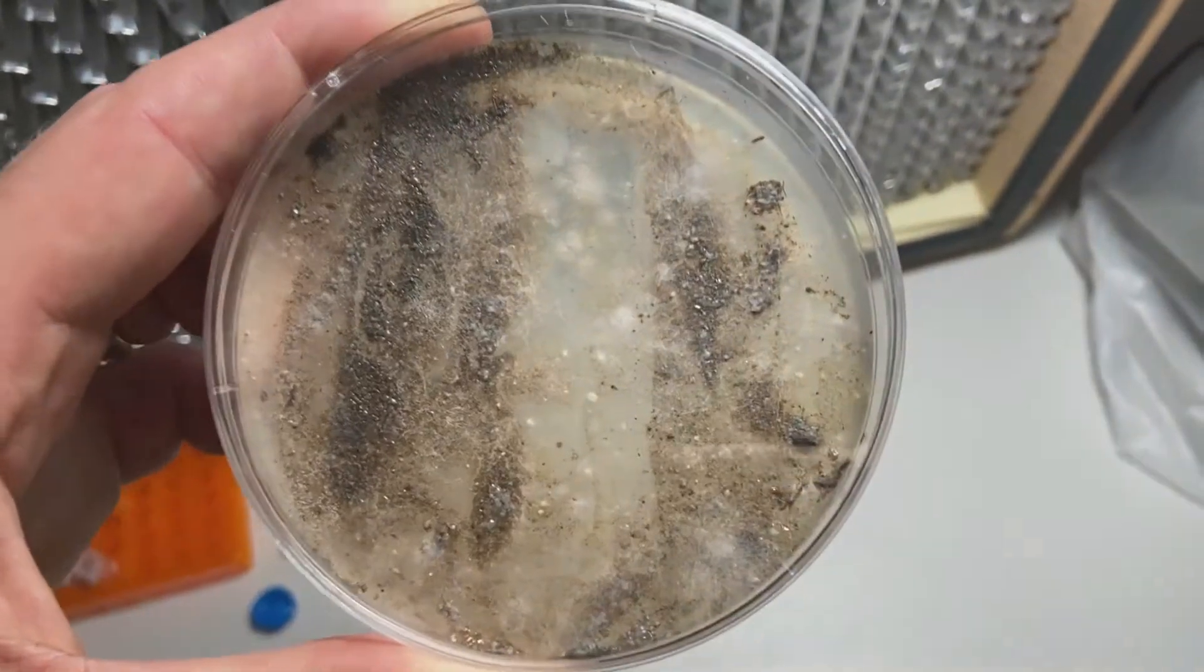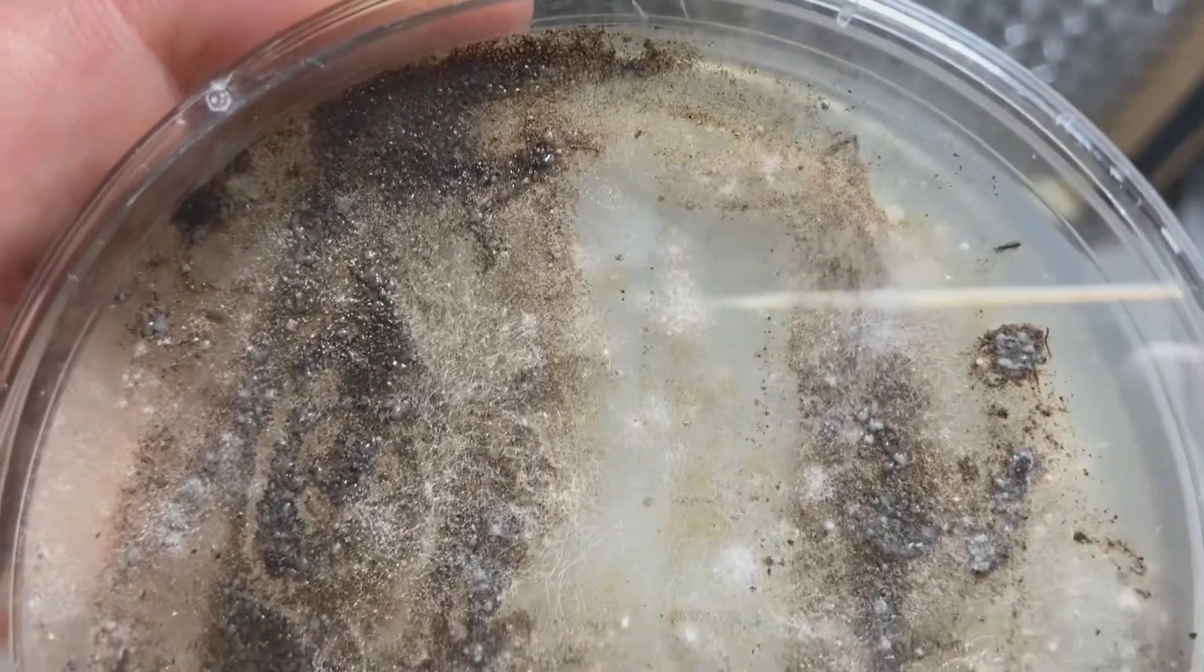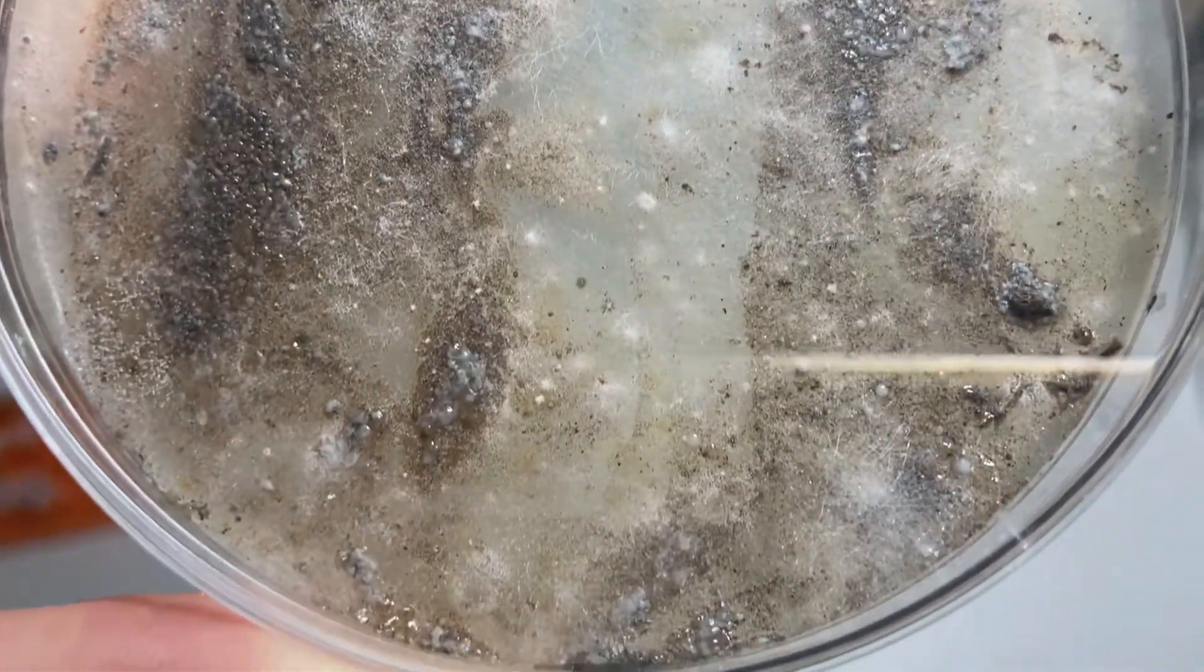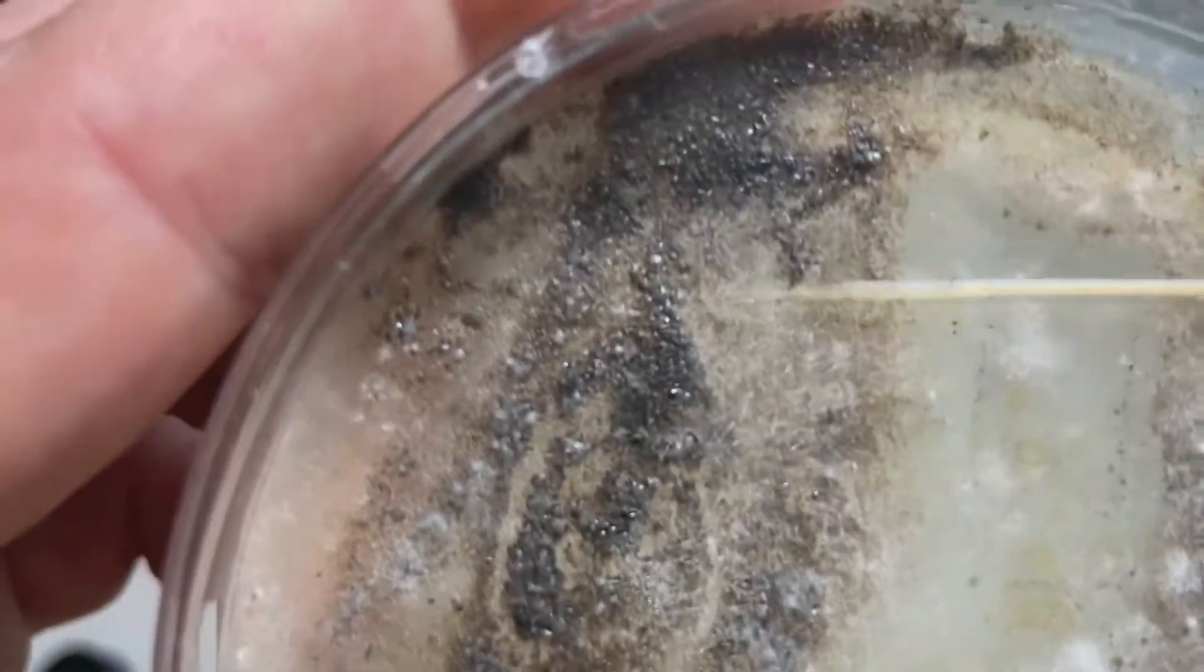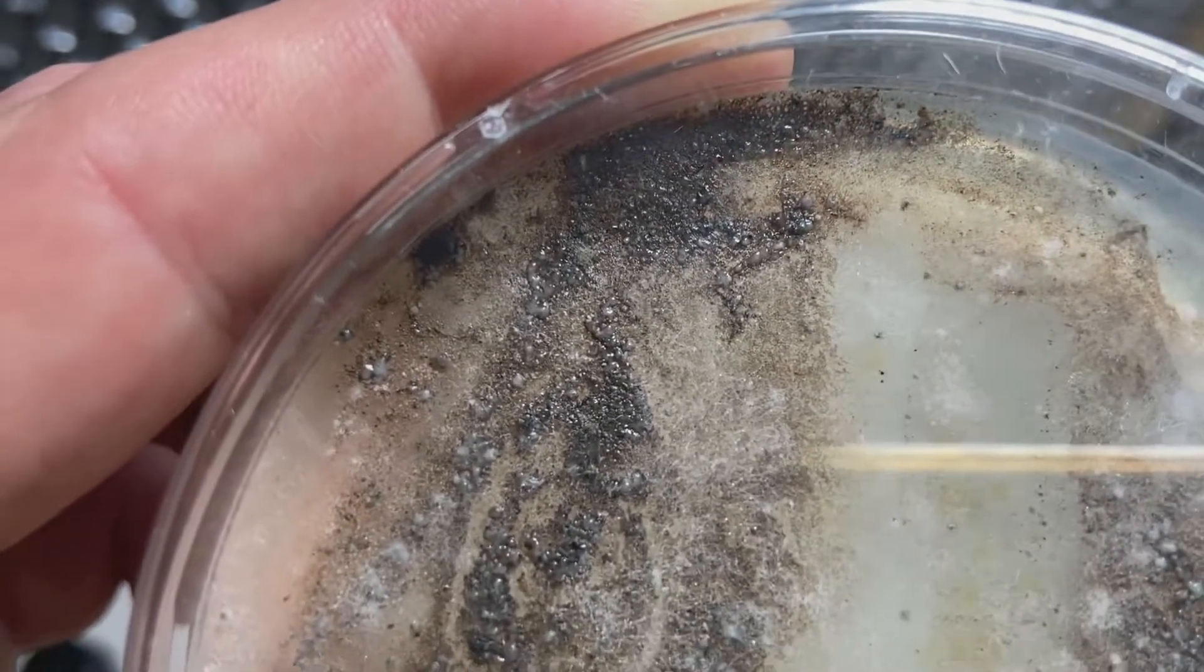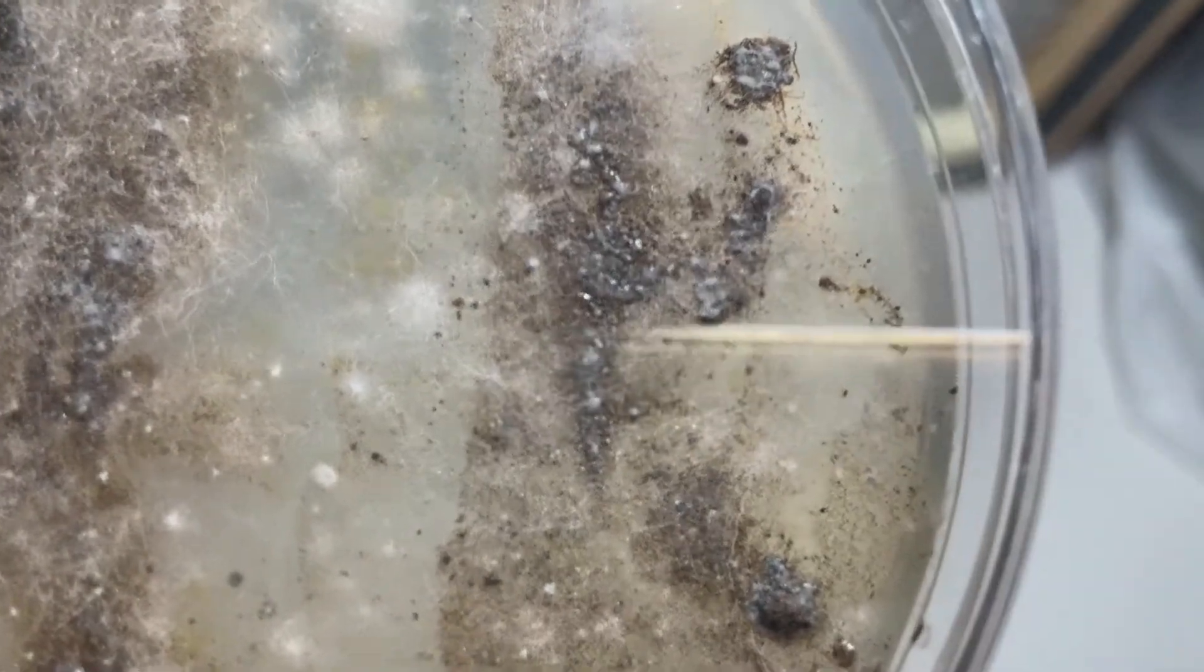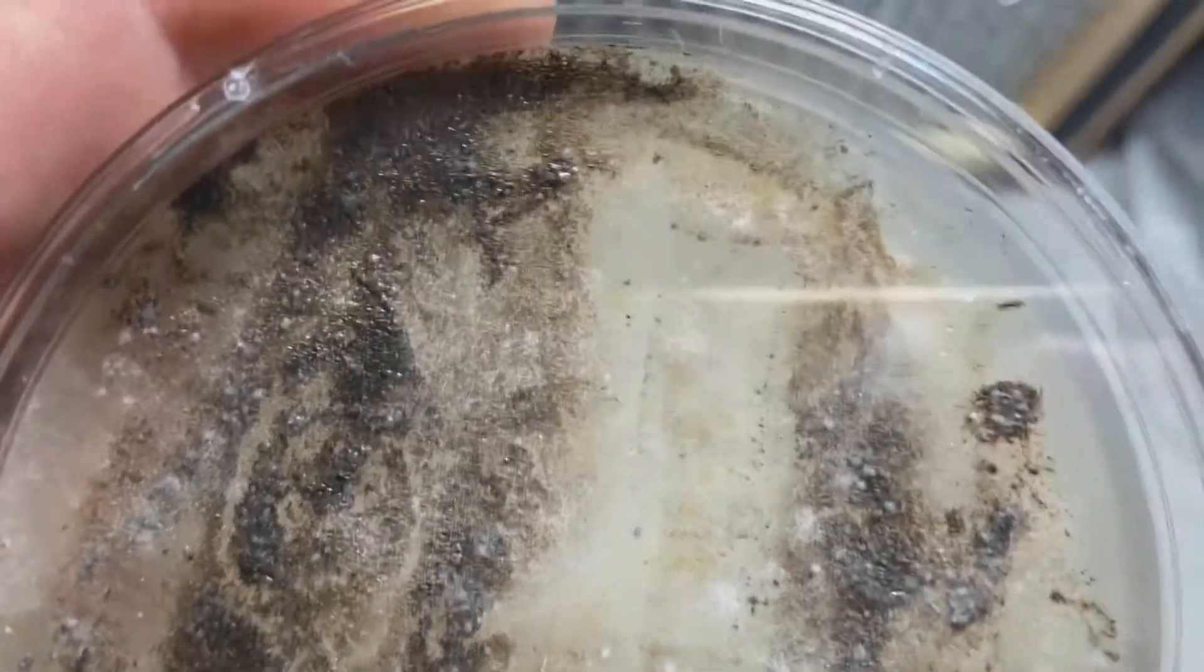After 24 hours, the LA River soil plate shows significant fungus growth. All that white wispy stuff and each little white dot is fungus. You can see bacteria growing with a shiny appearance, which is interesting because this plate has kanamycin on it, so these are either resistant to kanamycin or something else altogether.